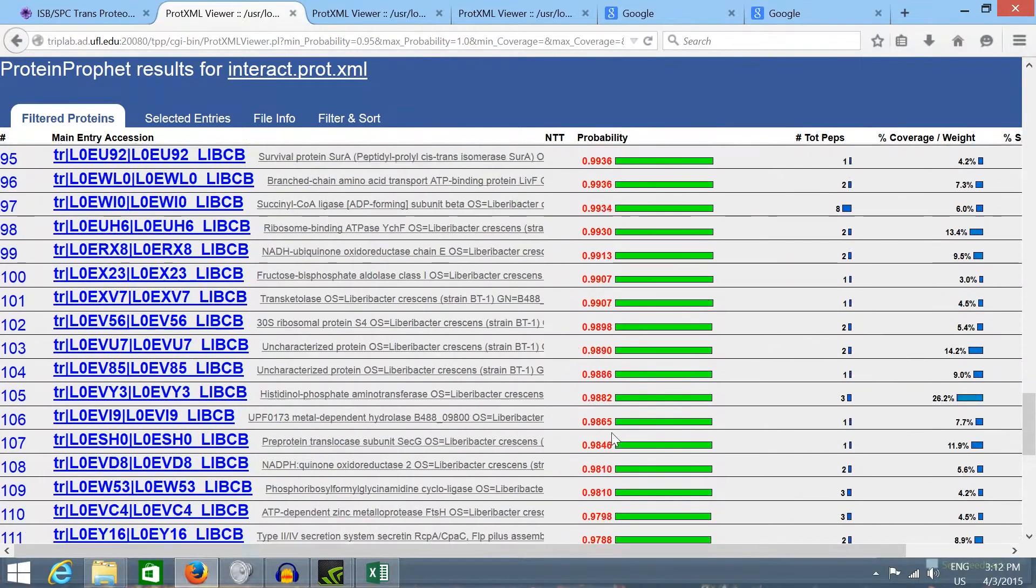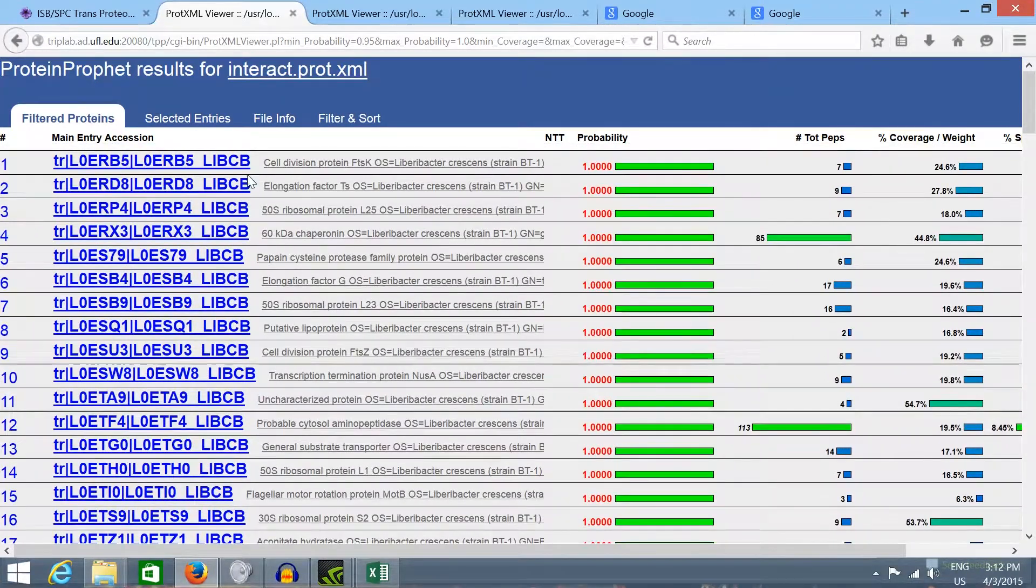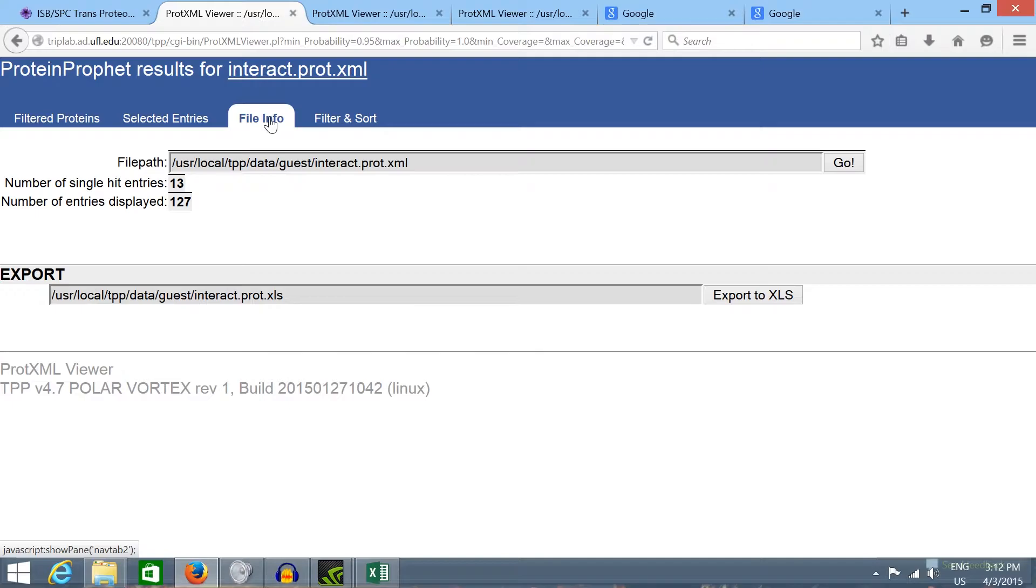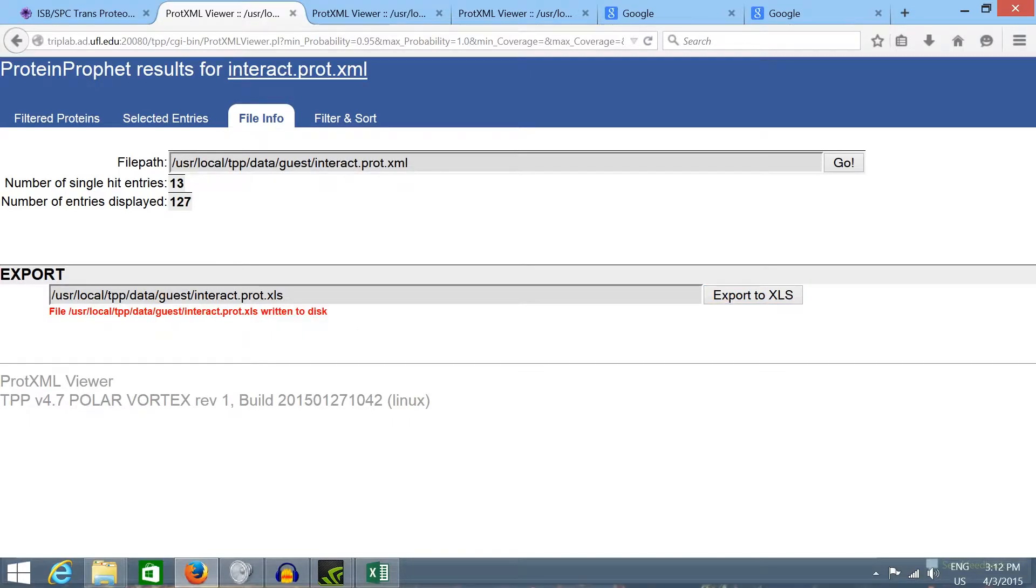Now for exporting these results we're going to click in the file and info tab and click in export. Now the results should be exported in Excel format.